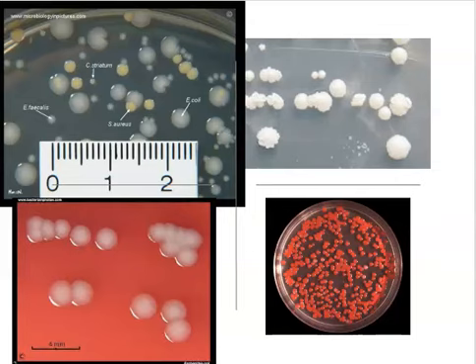In other words, if you see colonies on a plate that all look the same, you could have one species of bacteria growing, or you could have two species or more growing that all have the same colony morphology. So we can never look at a plate and know for sure that we have only one species growing. We have at least one species growing. Make sense?